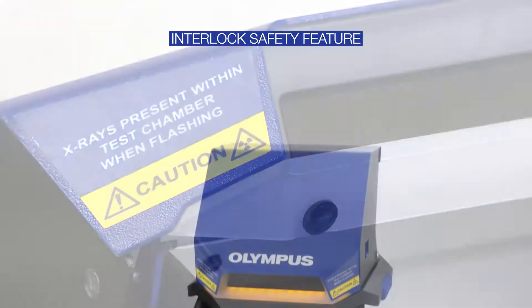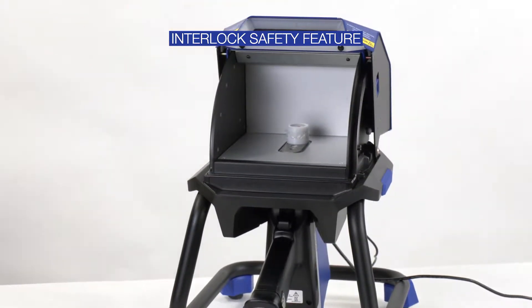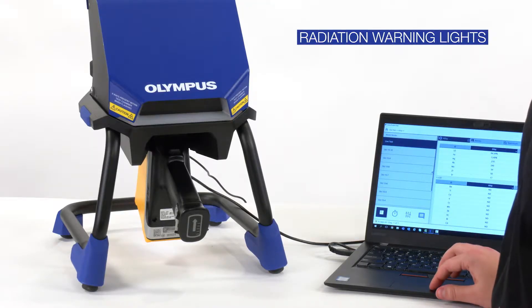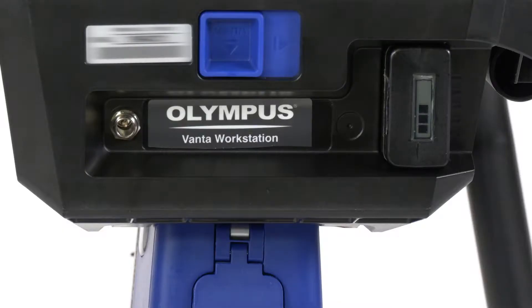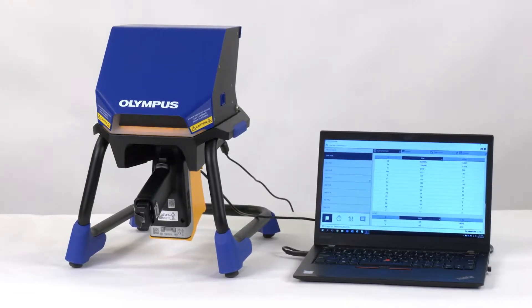The workstation is fully interlocked. This safety feature helps ensure the Vanta analyzer stops emitting X-rays as soon as the lid is opened. Radiation warning LED lights prominently display at all angles during a test. On the back of the instrument, you'll find the battery compartment and power input jack. The workstation must be powered for the interlocks and lights to work.